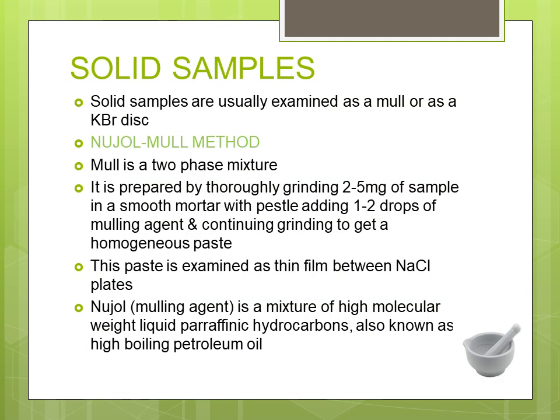Then how to introduce solid samples? Solid samples are usually examined as a mull or as a KBr disc. So we will see them one by one. First one is the Nujol mull method. A mull is actually a two-phase mixture. And how is it prepared?